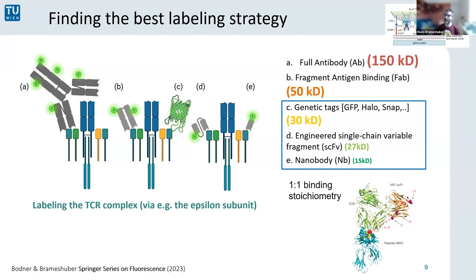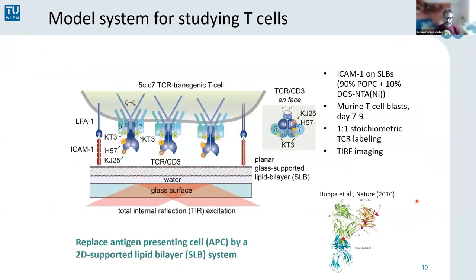So every single chain carried exactly one dye molecule with 99% efficiency. And because of the tiny size, we could also target nearly all T-cell receptors on the T-cell membrane. You can also tune your imaging later by choosing the dye of your choice. For this study, we mostly use the Alexa dyes for several reasons, which I will go into detail in a few minutes.